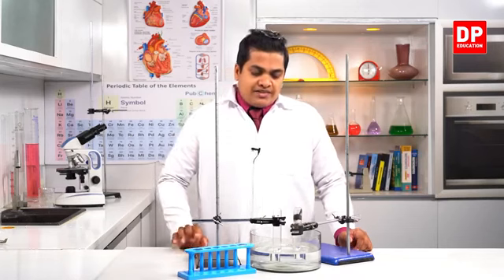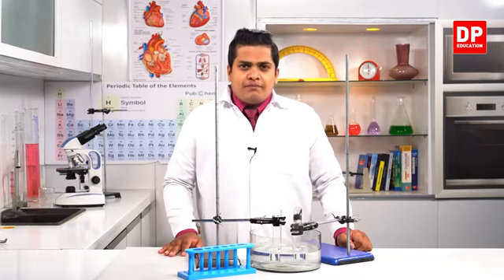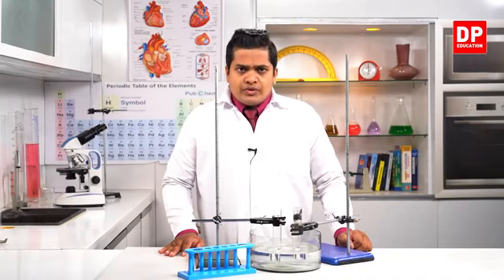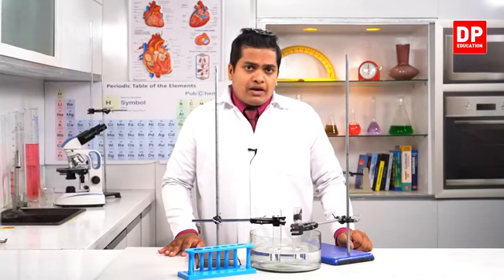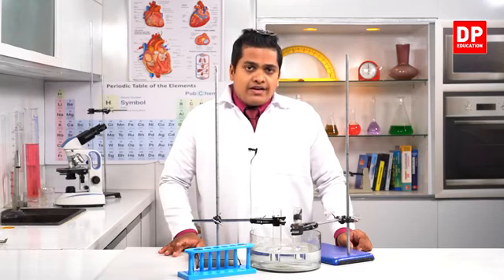If I keep this setup in the same way, I won't be able to compare my observations very clearly. So I'm going to add some coloring to this water. After adding coloring, you can observe the two water levels very clearly.